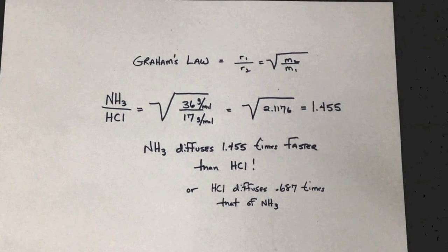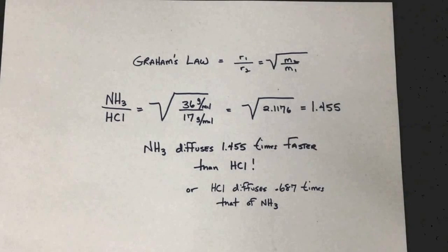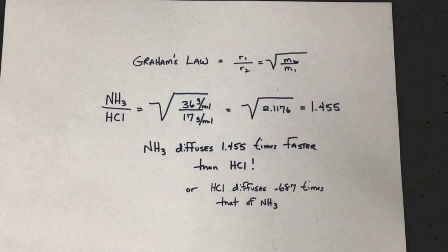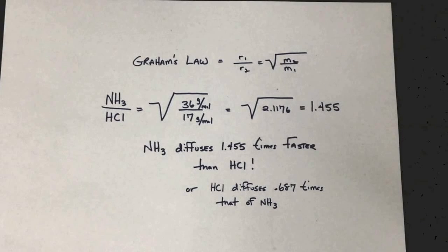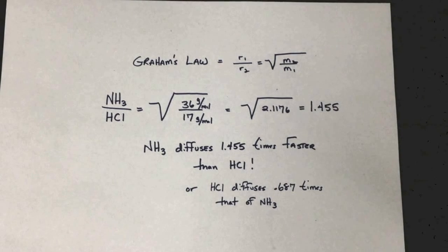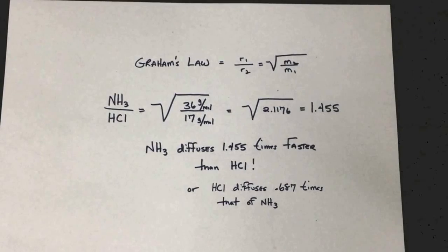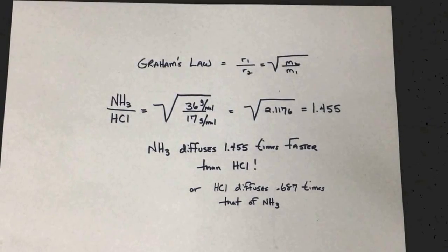that would mean that 68.7% of the distance between the two gases is due to that line, the ammonium chloride. So that's because the NH3 is faster. So that line of NH3 meets HCl 69% of the distance between them.